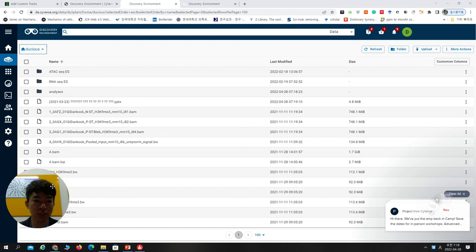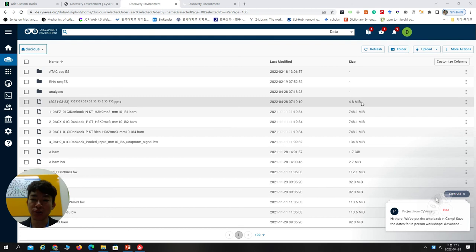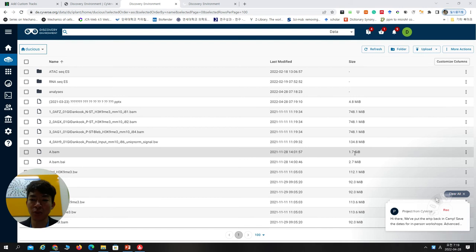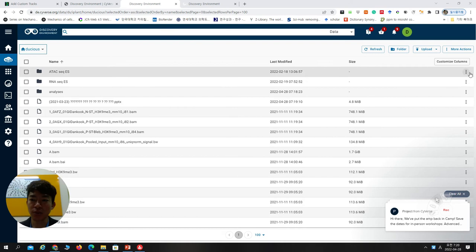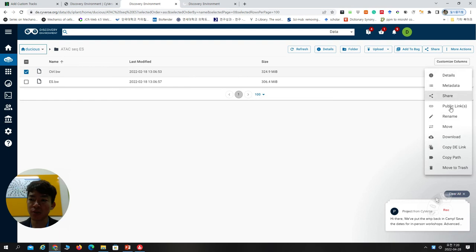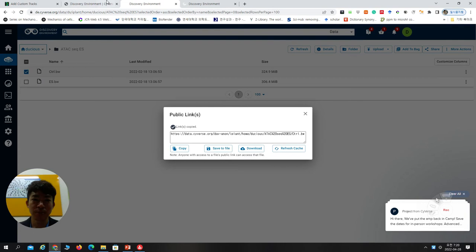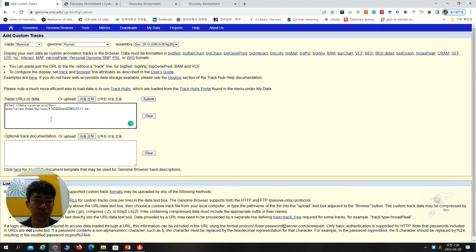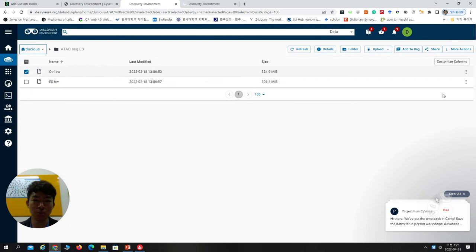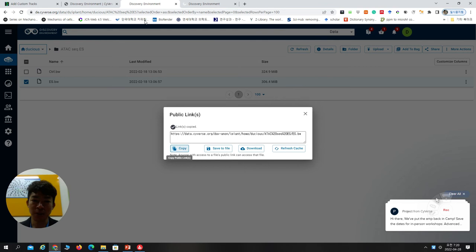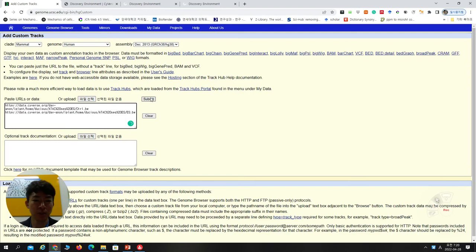When you successfully upload, you can see the file listed. Small files are quite fast, but for 700 MB or 1 gigabyte, it can take one or two hours — in that case, keep your computer on. When you visit the uploaded file, you can find the public link. Copy that public link, go back to your Custom Track page, paste it with Ctrl+V. This is the first control group, but I also need another experiment group — the ES group. Copy its public link too, then submit.